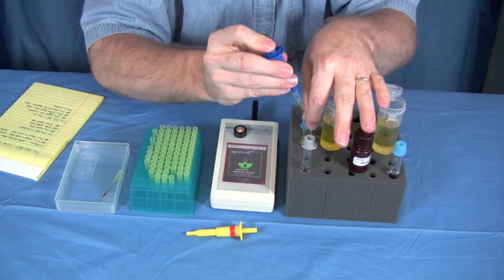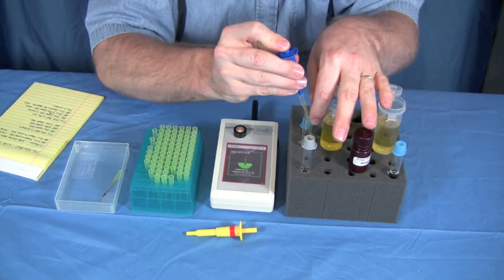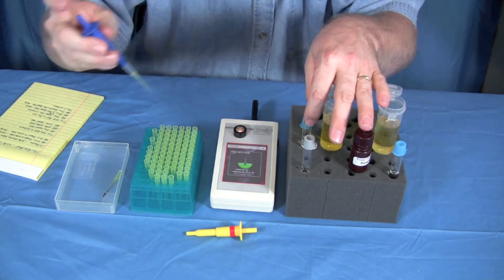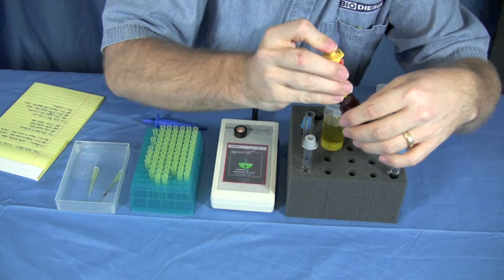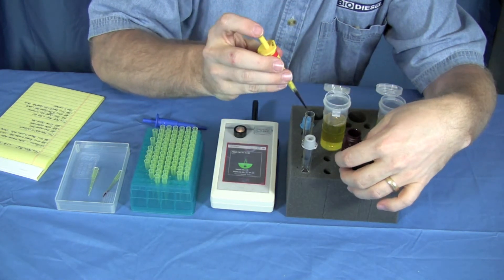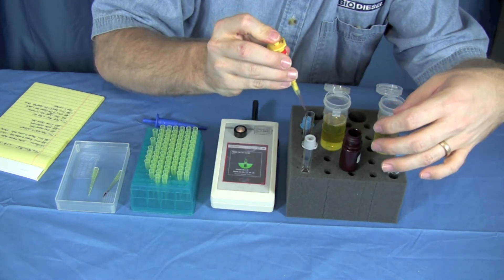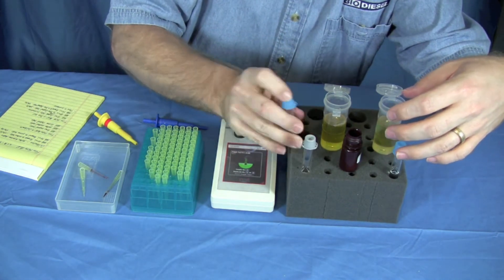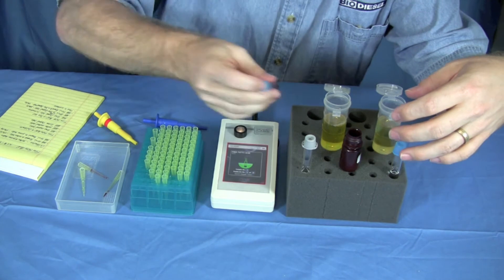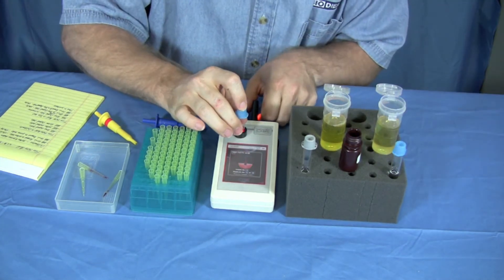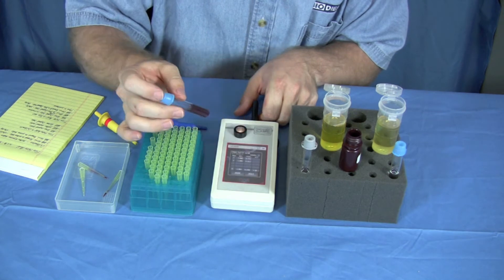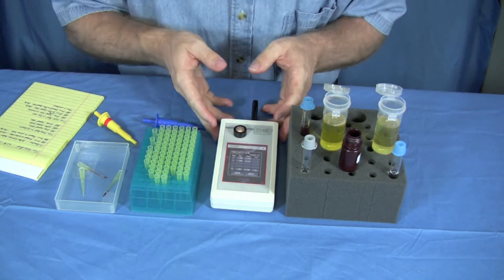We put 100 microliters in our sample there. Make sure that you don't get bubbles. Put it in and cap it and shake this fairly vigorously. Put it in, remove it, put it in, remove it, and the test is done.